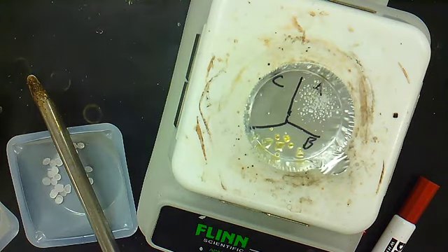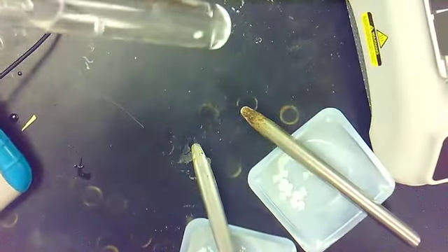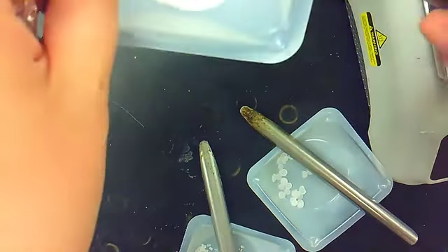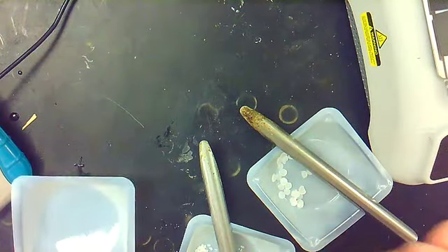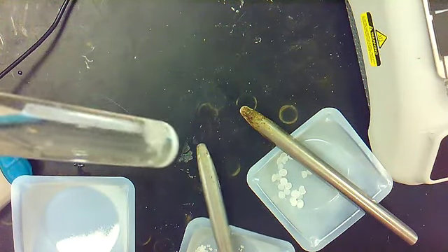Okay. Now we're going to dissolve our chemicals. Okay. So again, this is just clear water, and I'm going to put substance A. Okay, substance A. Just going to put a little bit into the test tube. Okay, notice how it settles out.